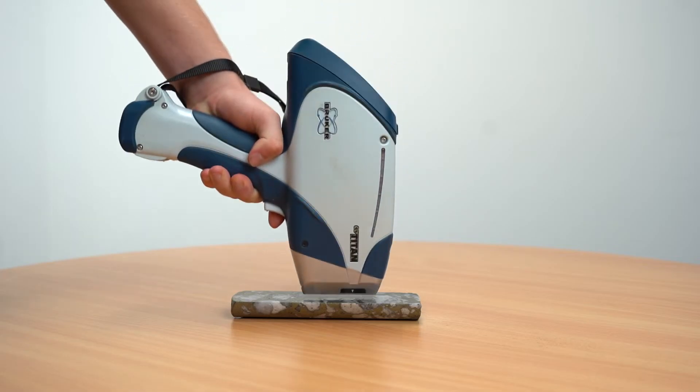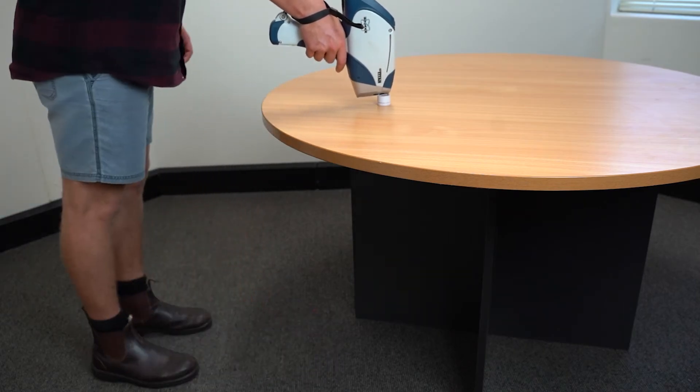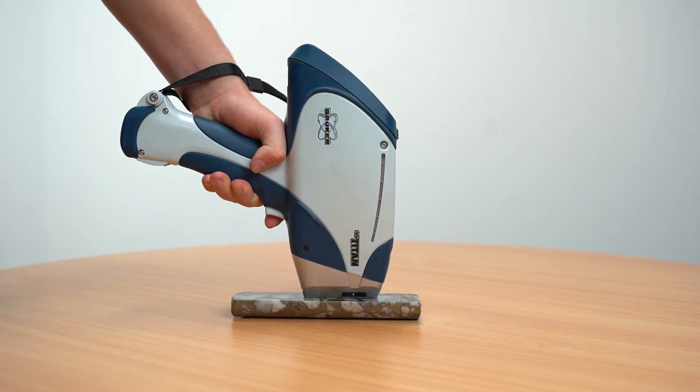For all analyses you want to hold the instrument like this and make direct contact with the table. It is best at a 90 degree angle to the sample. Ensure your feet are not directly underneath if analysing on a table, for radiation safety.